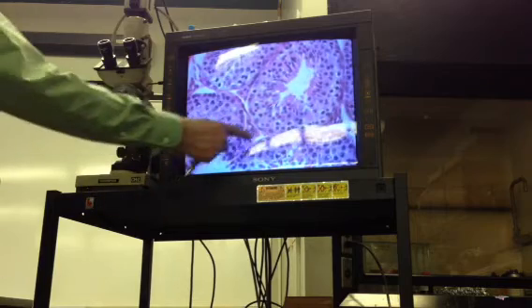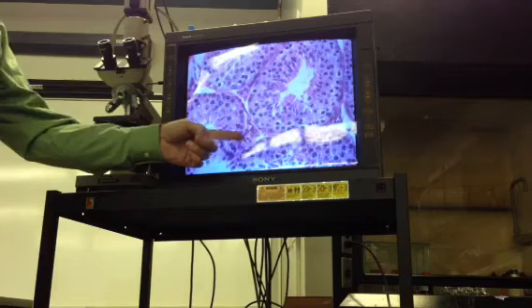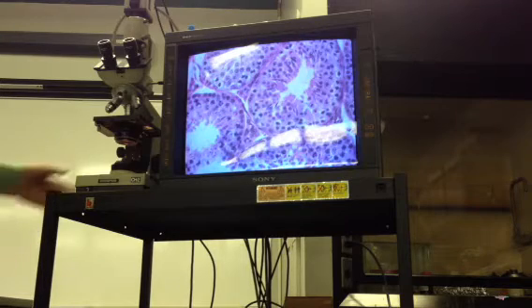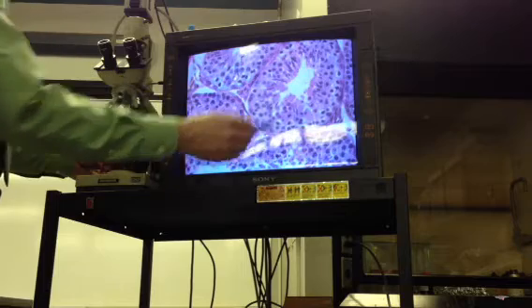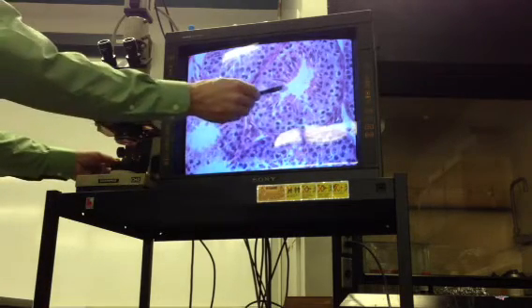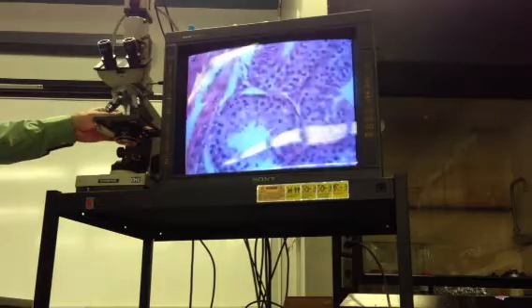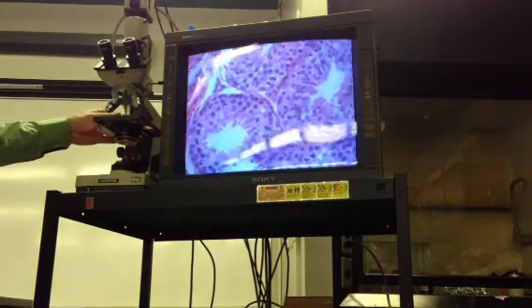Anyway, Leydig cells are obviously there. LH makes testosterone. It's FSH that stimulates the Sertoli cells to support spermatic growth. You see these little round things with no nuclear staining, no purple stain? These are residual bodies. It's like eggshells. Sperm sort of hatch from eggs. Remember? Anyway, this is a very nice view of the seminiferous tubules of the testis.